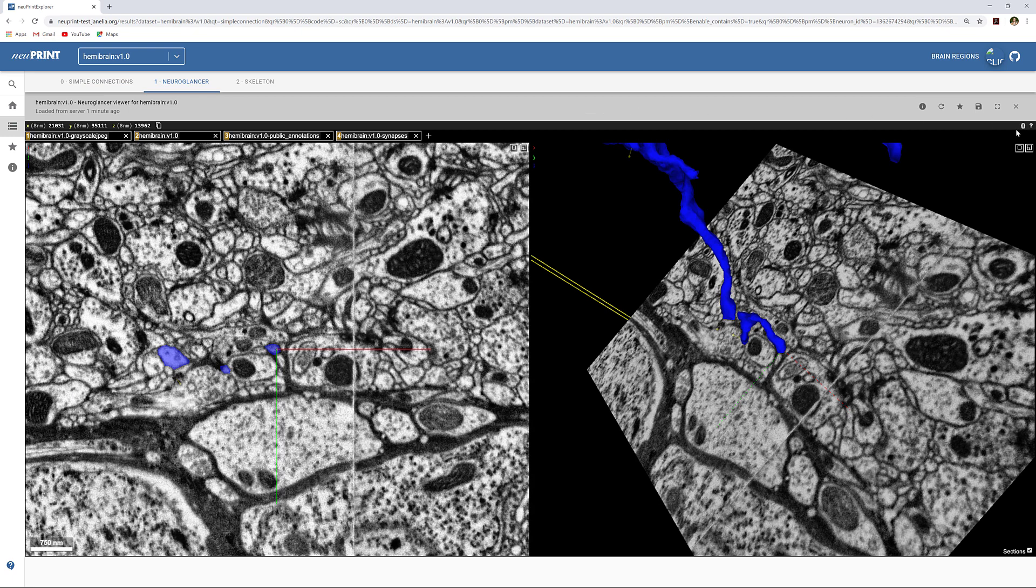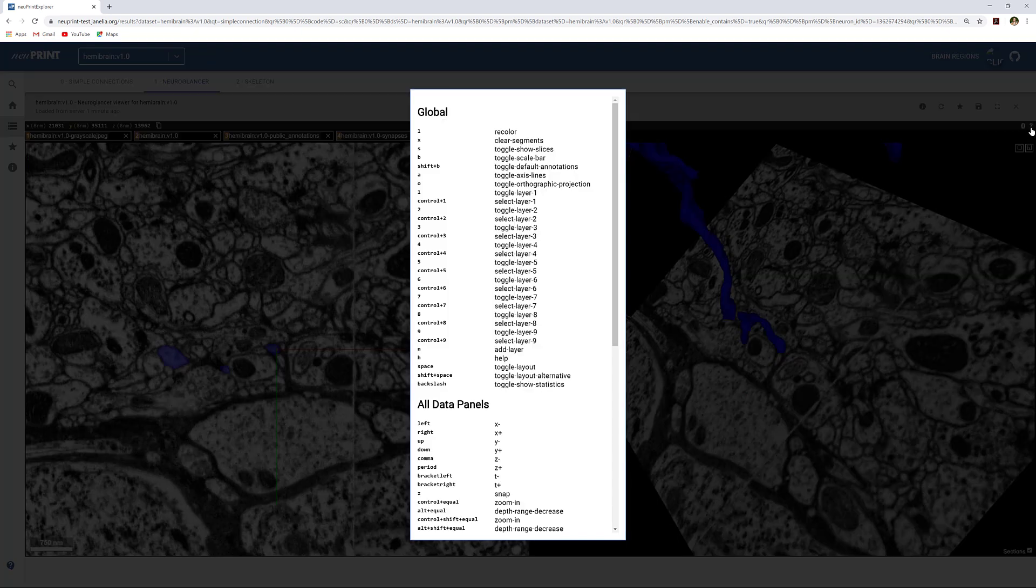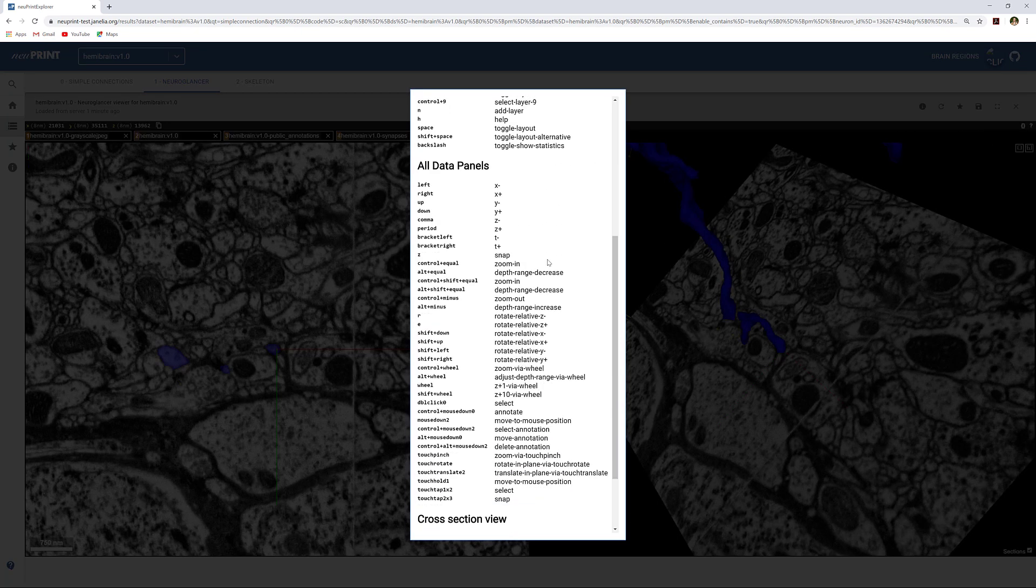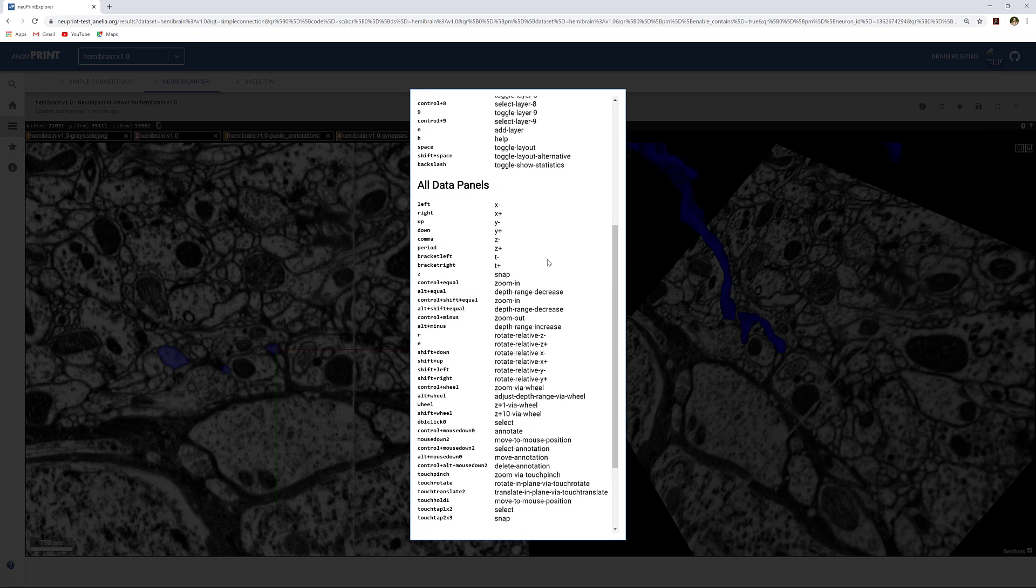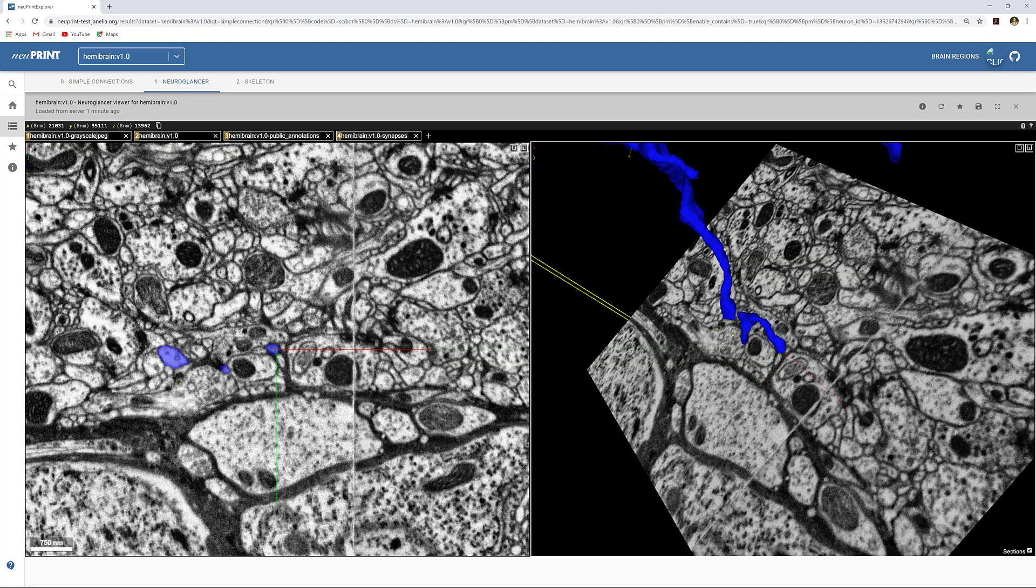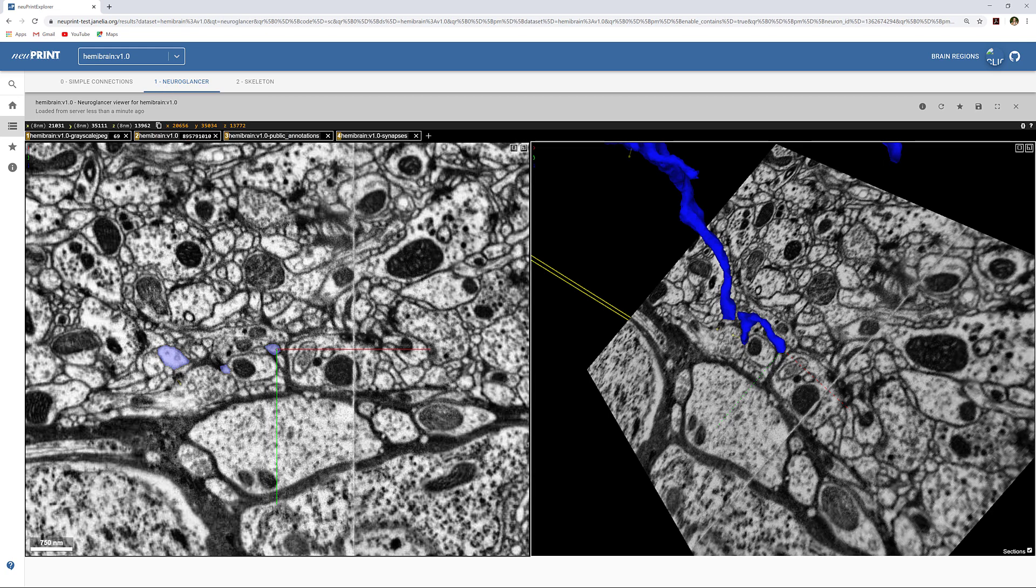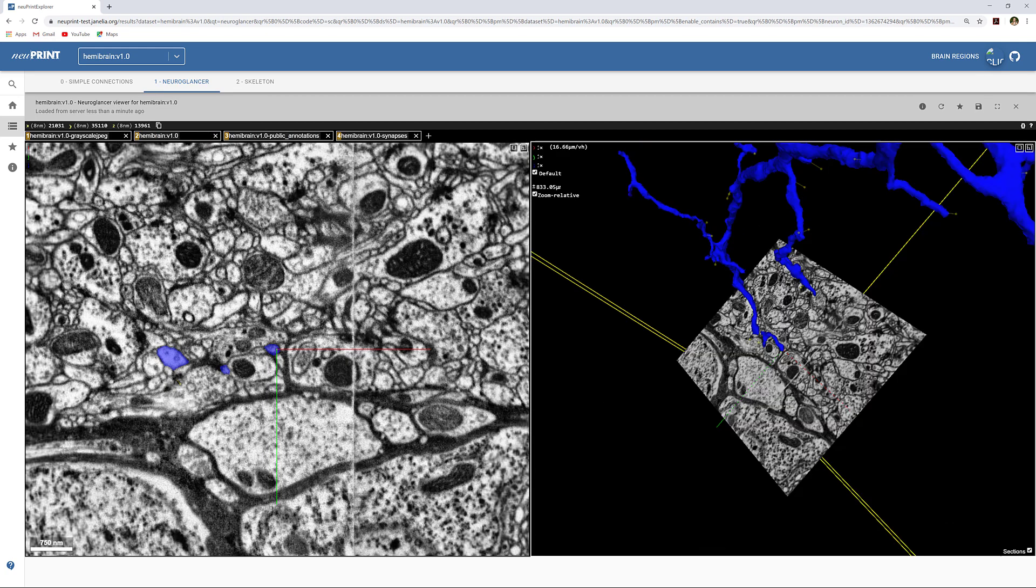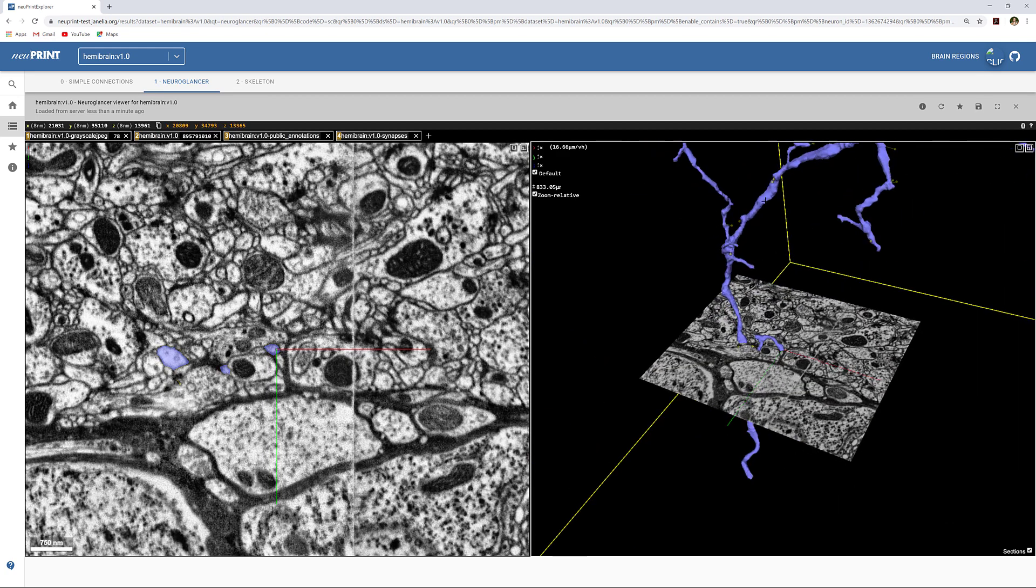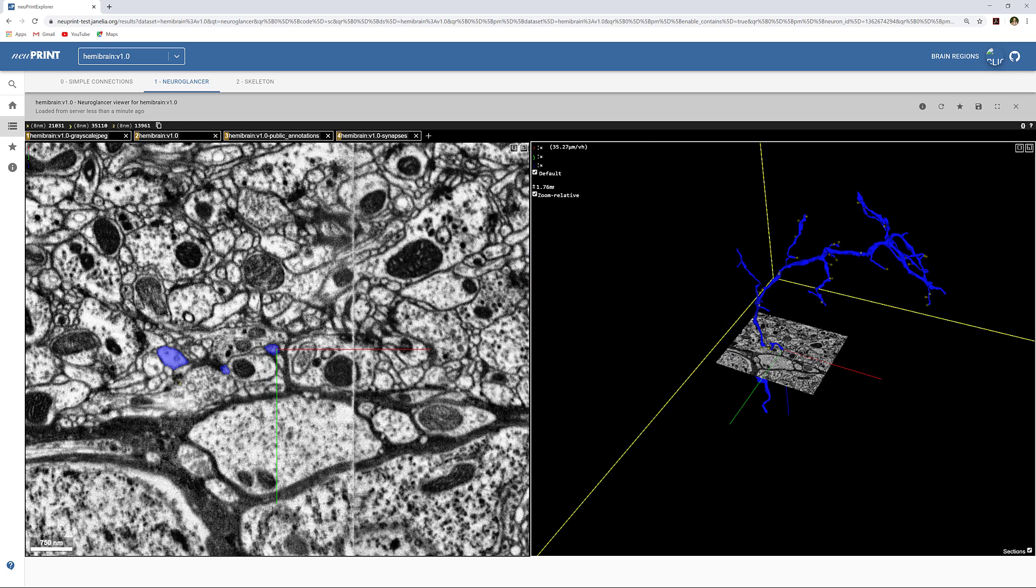Clicking this question mark will pull up a list of the controls for NeuroGlancer. Hit Escape to close it. Here, we can see our body. Control-scroll will zoom in and out of the body.